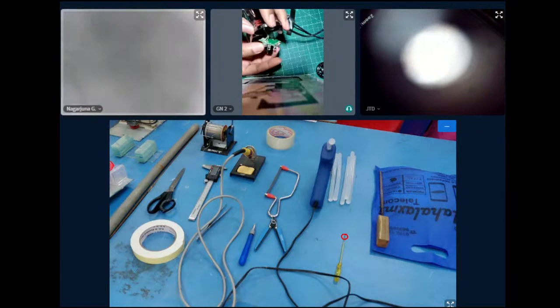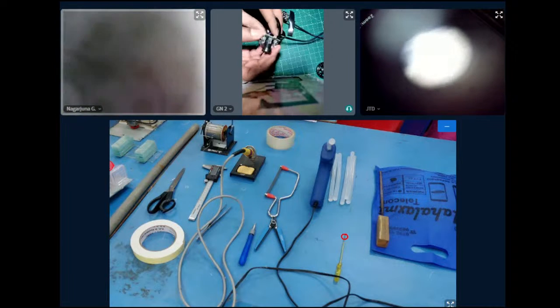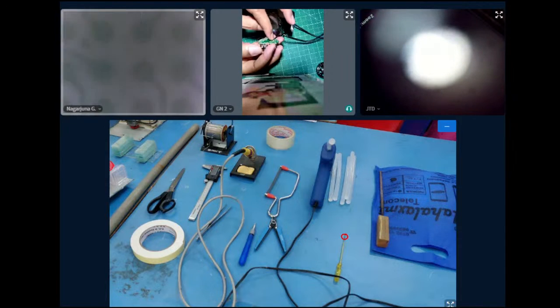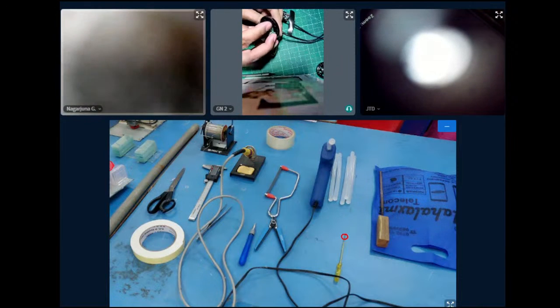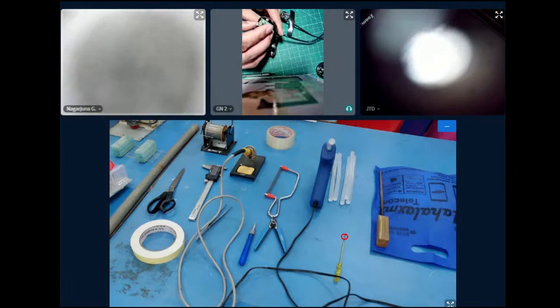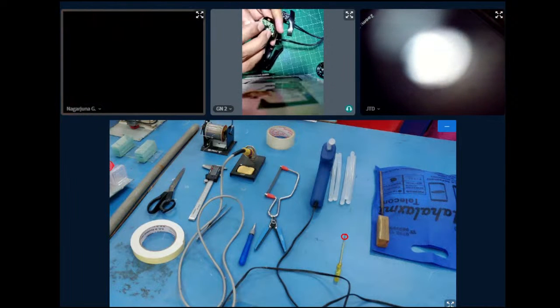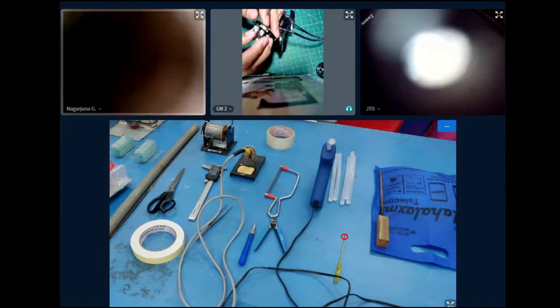If I remove this, even though the light is closed, there is a lot of light. That is happening because this green board is transmitting light. So that is what is getting reflected, and the CMOS is responding to that. So that's why there should be no light from the back side. Correct. So that is what he was explaining. You understood now, right? Yeah.